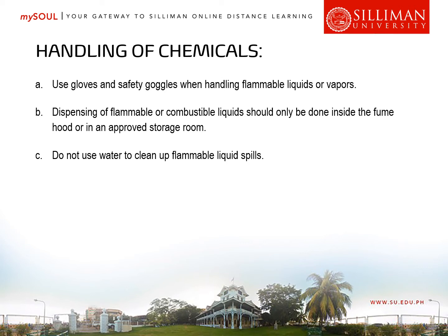Letter B, dispensing of flammable or combustible liquids should only be done inside a fume hood or in an approved storage room. Okay, for chemicals that emit toxic fumes, please do not process or deal with them in an open working area. You have to place them inside chemical fume hoods. And number three, do not use water to clean up flammable liquid spills.